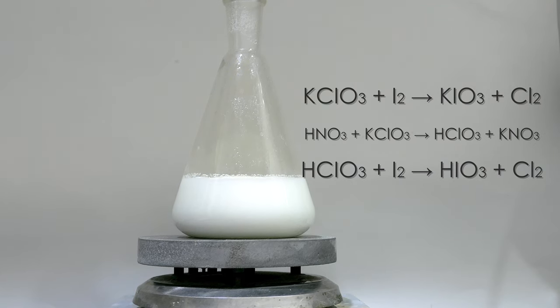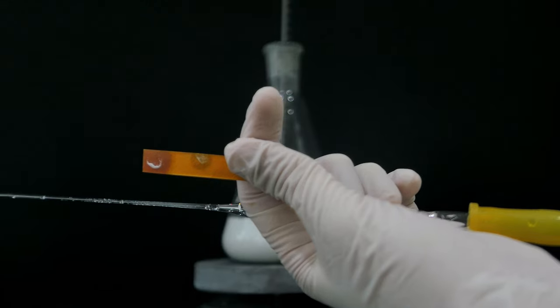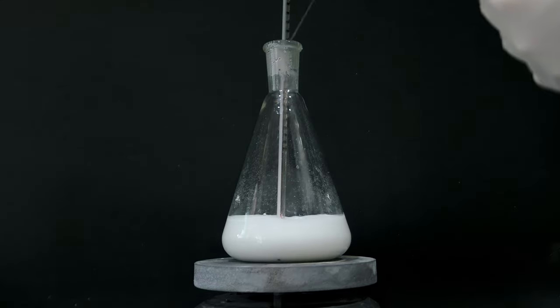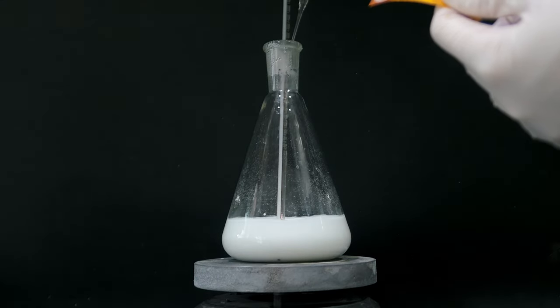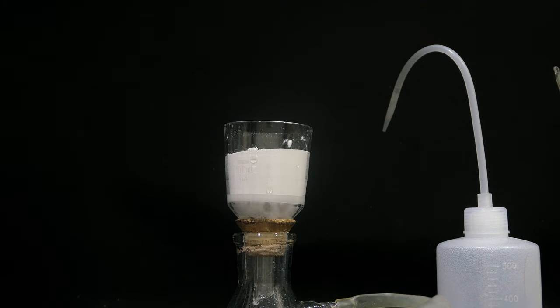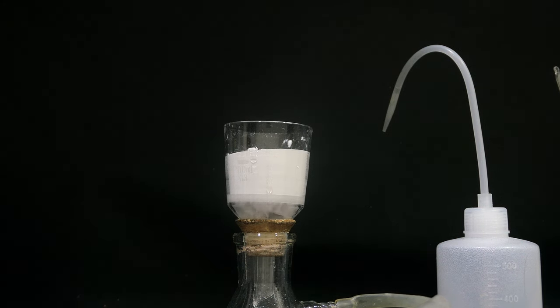After the iodic acid is generated, the solution becomes acidic, and it needs to be neutralized with potassium hydroxide. I am adding the hydroxide solution dropwise until it reaches pH 9. Then the solution is allowed to cool and vacuum filtered, and finally dried in an oven.